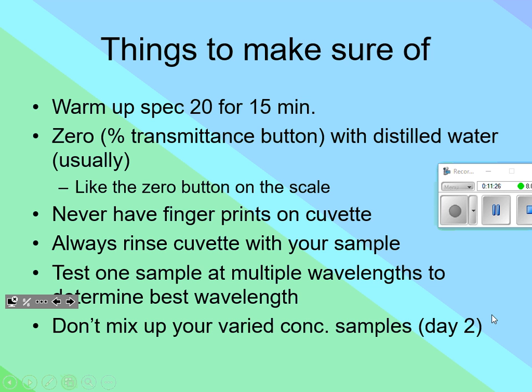There's little things though. If you take future chemistry courses in college, again, in a couple class periods, I'm going to show you the scales that we use in AP Chem that go up to the thousandth of a gram. I've had scales that go even further than that, where your fingerprints on a scale can affect the results. So we got to get rid of the fingerprints part.